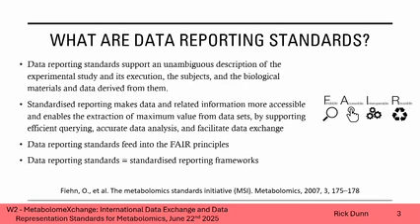And that's really important. So as we've heard before about being AI ready, making sure that it's standardised, all the information is available. And if you can imagine across a whole study, there is a lot of information that could be included, but it's actually what needs to be included to be able to interpret that data. And it's not necessarily everything that you've done. So we want data reporting standards to feed into the FAIR principles, and we'll hear more about that tomorrow morning in one of the first workshops.